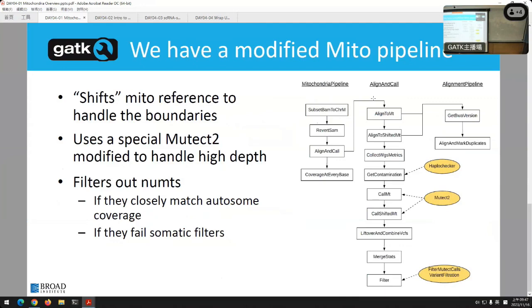They become significant. And that makes it very difficult when we're trying to go in and align things and reconstruct the graphs. You get crazy graphs if you aren't careful, because there's a lot of noise in there all of a sudden. Just that amount of reads means that just errors pile up. You start getting these noisy graphs. So there is some tweaking we also had to do to Mutect2 to be able to handle that.